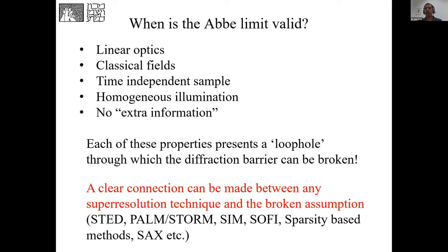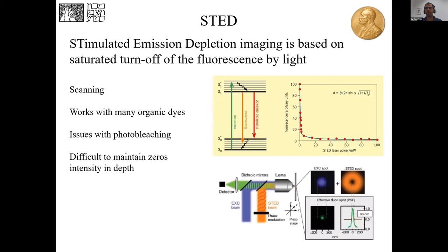And you can make a clear connection between any super-resolution modality known today and the broken assumption. So let me show you in the next two slides a couple, and then I'll talk about breaking the fact that you have classical fields, or how we can use quantum principles to break the diffraction barrier.